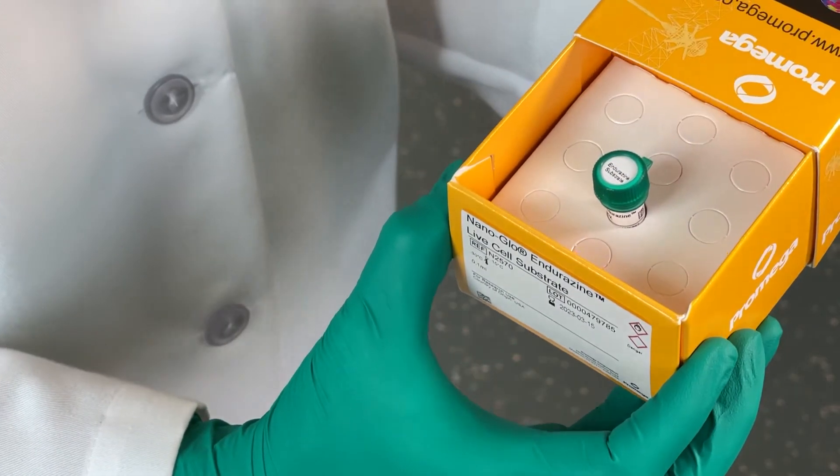Hi, I'm Sarah Mahan, a research scientist at Promega. I routinely run 24-hour kinetic assays using the GloMax Discover plate reader to study protein degradation with our NanoLuc assay technologies. Let me show you how easy it is.